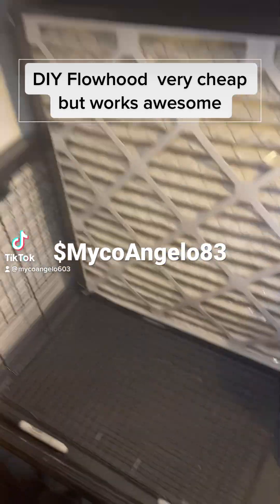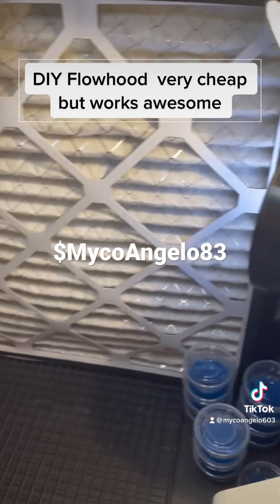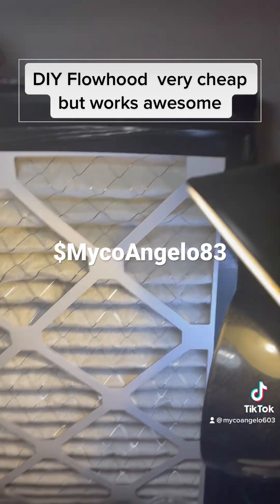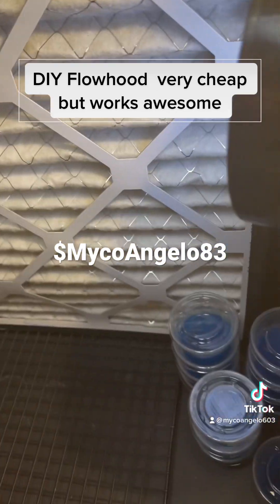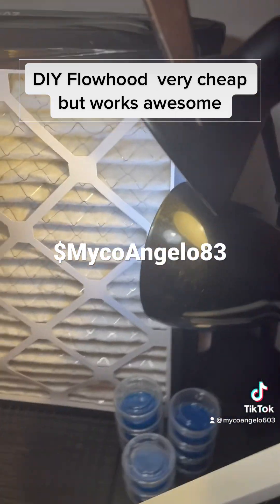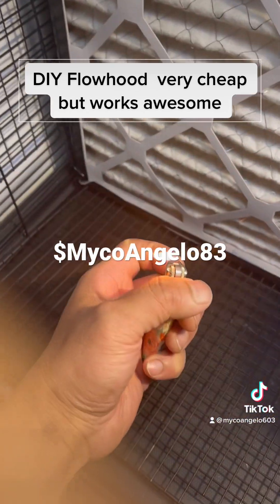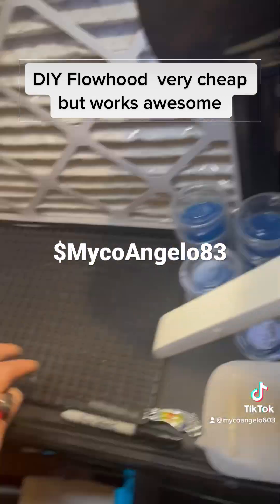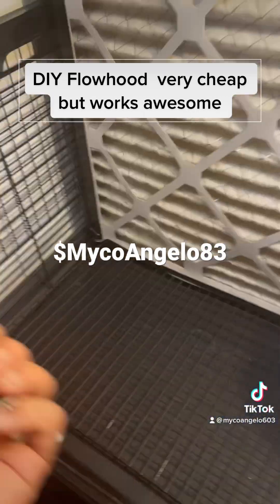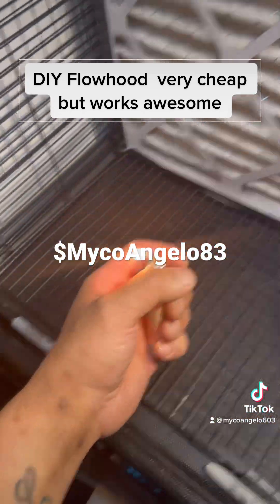I wanted to show y'all my box flow hood. I got a filter — same one like this in the back and then one in the front. It works pretty good. I barely get any contaminations. It just works like 90% of the time; 10% I get contaminations.